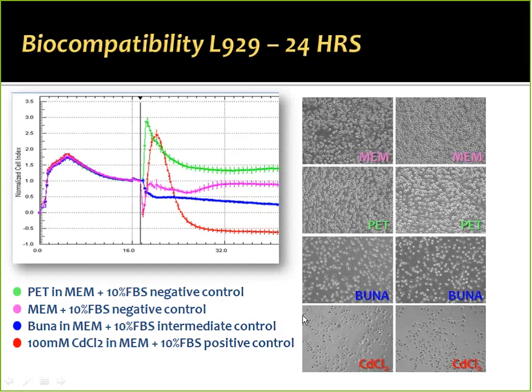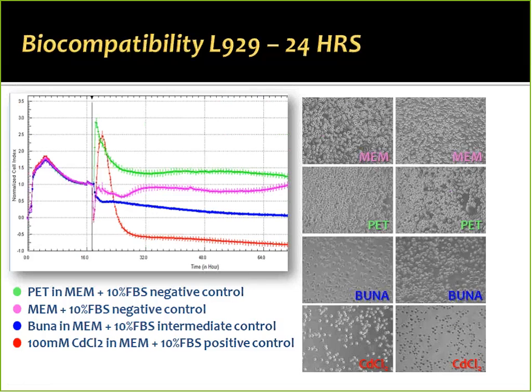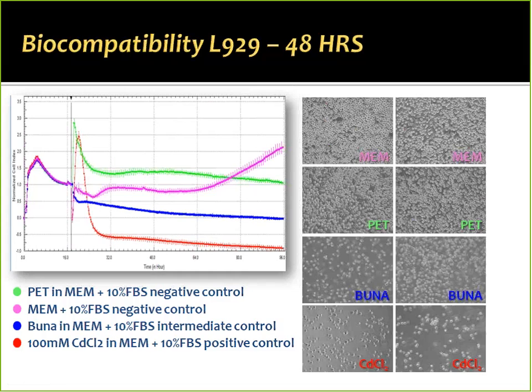So this is an example of when things are very easy to tell by eye what they're really doing. But there are cases when it's a little bit more tricky to see these effects by eye. Of course, this is just the same results at 48 hours, comparing by eye, and then at 72 hours.